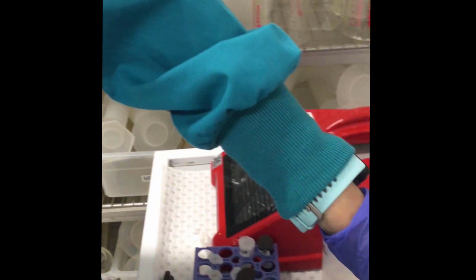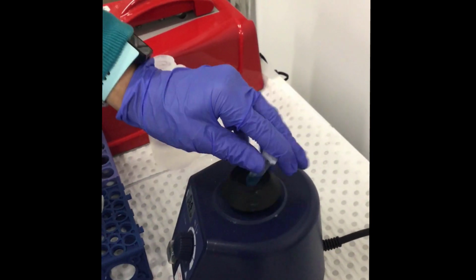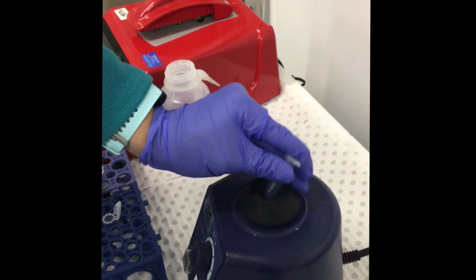We're now going to vortex it to give it a good mix. Today we're using 100-degree heat blocks, and this means that there's going to be quite a pressure build-up in your tubes. You don't want that, because the gas builds up, causes the lid to pop off, and the sample could splat your face, or worse still, your partner's face. So you're going to have to puncture the tubes.